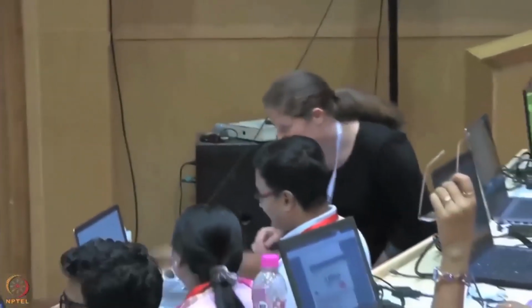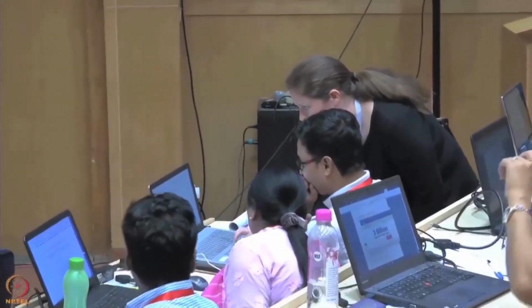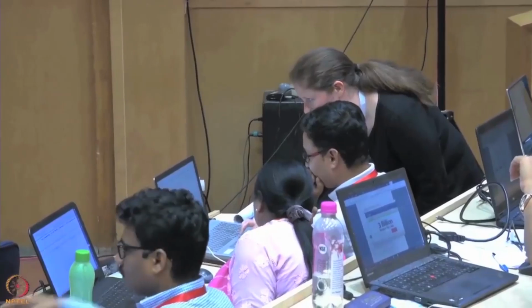Show translation. If you're only getting the nucleotide sequence and not the amino acid sequence, left click and it'll give you some options, or right click, and it'll say show translation. So click on show translation and then it will show you the 3-frame translation. Yes, same thing. So if you right click, okay, show translation.